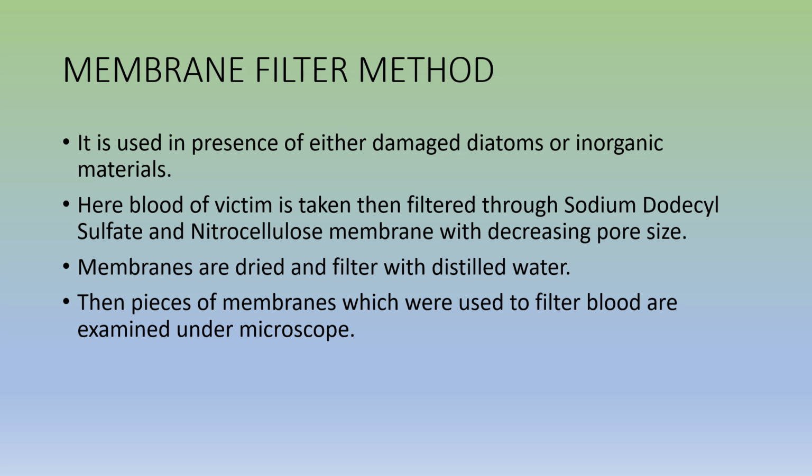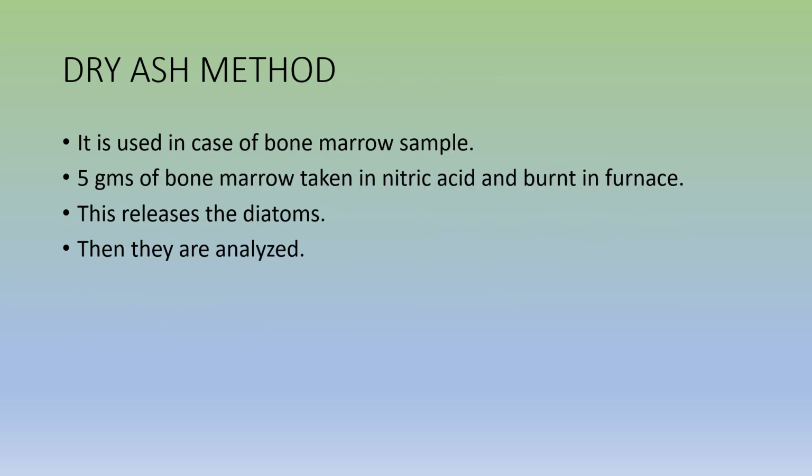The membranes that were used for filtering are then dried and again filtered using distilled water. Then these membranes are examined under the microscope.